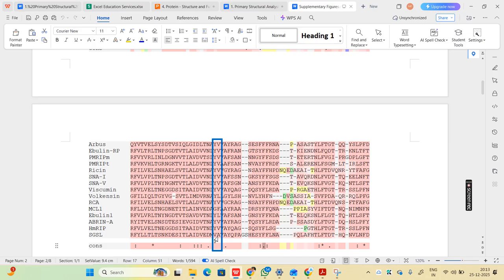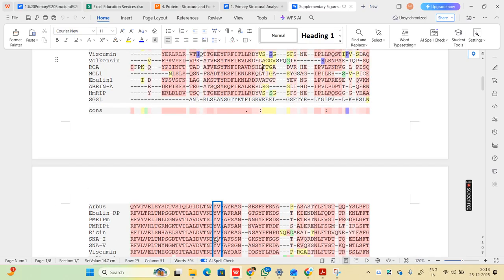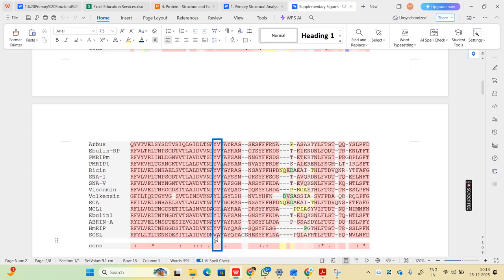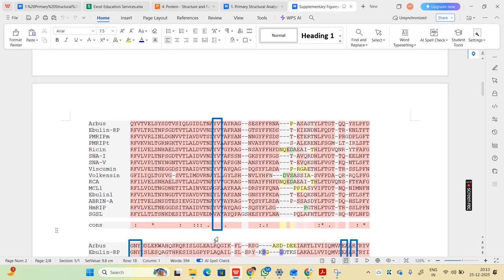Generally, whenever we give multiple sequences and ask the tool to align, it will align in this way and show the gaps, and this is the thing we need to look at. It is shown as star or colon or dot. Here I am taking many sequences, about 10 plus, so the conservation will be very less. Suppose you are comparing only human insulin and pig insulin, then you will get a lot of stars and a lot of colons, and very few empty spaces.